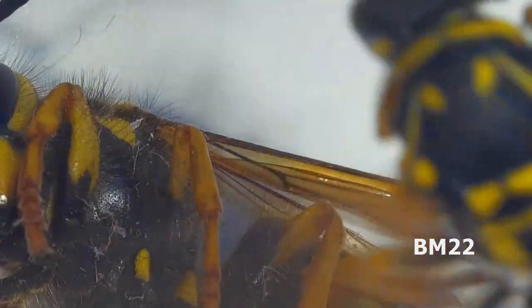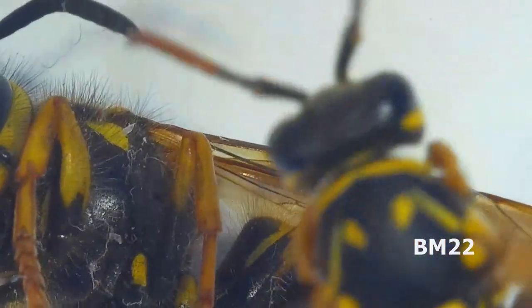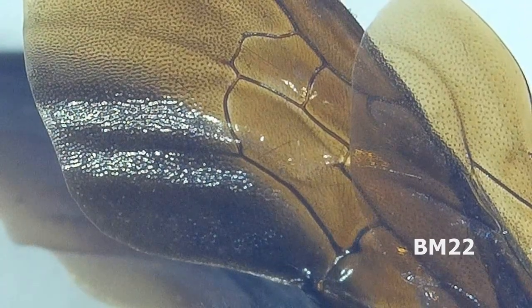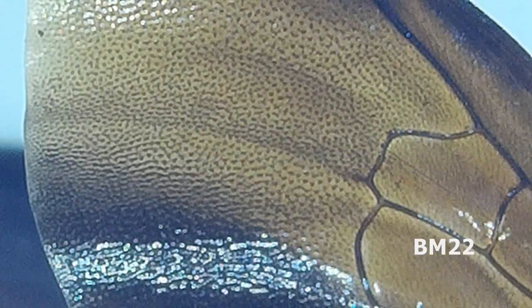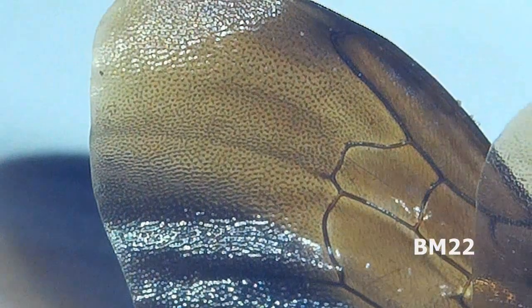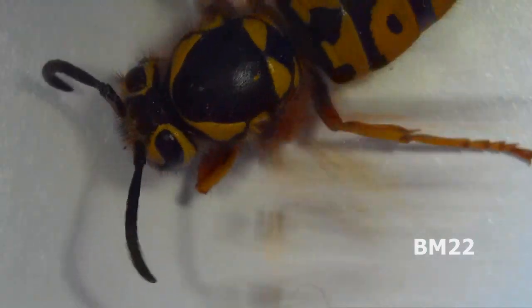This KK Moon video microscope — I still need to do a full review video on it. I've made a bunch of videos using it and still haven't done the review video. This isn't the first video microscope we bought. We bought that other one in the $100 price range, and it never worked right, and I still have to do a scathing review video on that. This one was in the $150-ish price range with a discount. But that step up of about $50 was night and day difference — you went from a plastic toy-ish thing that really didn't work properly to this microscope. It's got metal where the other one had plastic, and it has a light. Night and day difference. We're using a KK Moon video microscope, approximately $150-ish.